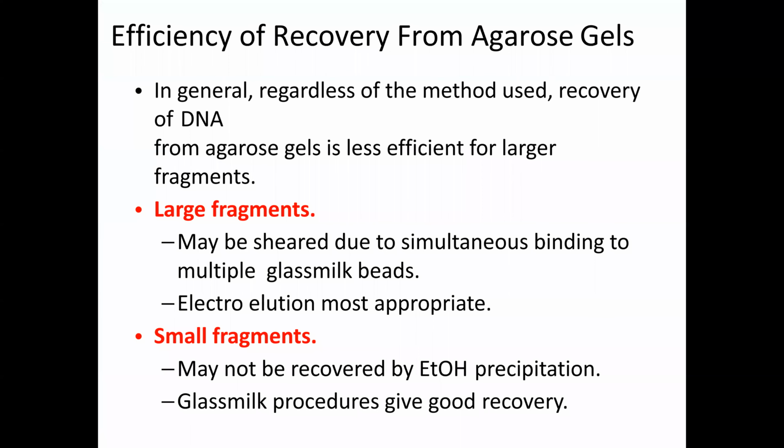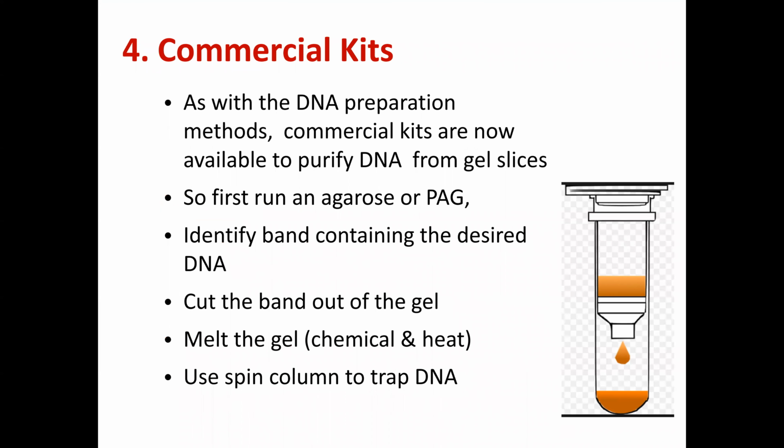As I mentioned, if you're going to use a commercialized kit, it is easy, fast, and more convenient for a molecular biologist, and could yield faster results. But of course, there's a tendency that it might not be so accurate, so we have to take note of the kit being used.